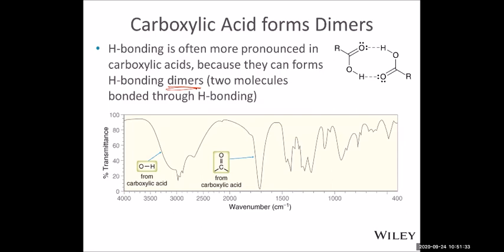And the shape for the NH, the amino group, has a very signature look, fairly strong. It's like a moderate, strong, and twin peaks. Not quite twin, but they're together, 2 peaks. So from these I can tell you there's an amino group in the molecule. Sometimes in organic chemistry, to identify what kind of amine is in the structure, we use the region around 3400 to see if there are 2 NH2 absorption peaks or not. Because there are 2 kinds of stretching: one is symmetrical, the other is asymmetrical stretching. And these 2 stretchings cause the difference in the frequency.